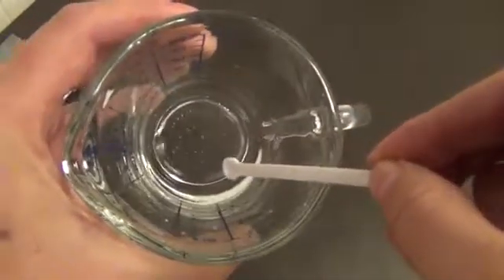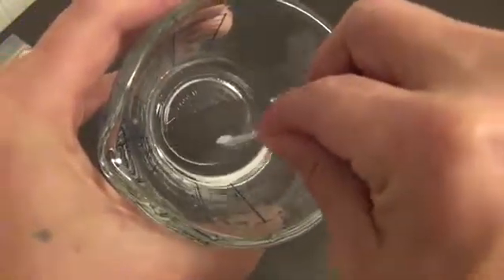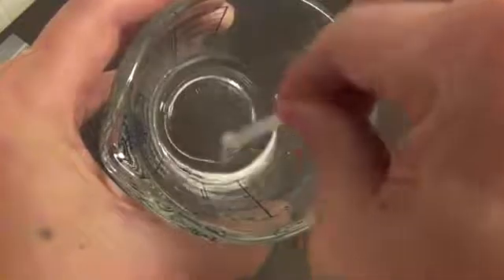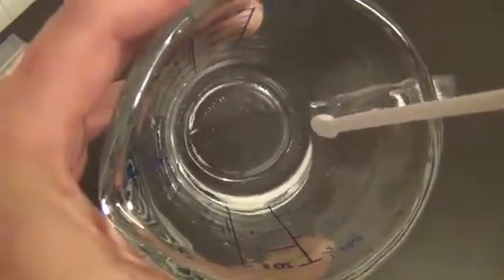There it is — it dissolved right up, except for just a little tiny bit. If I keep stirring, all that'll go away too. There you have it folks: dissolving BAP, very simple.